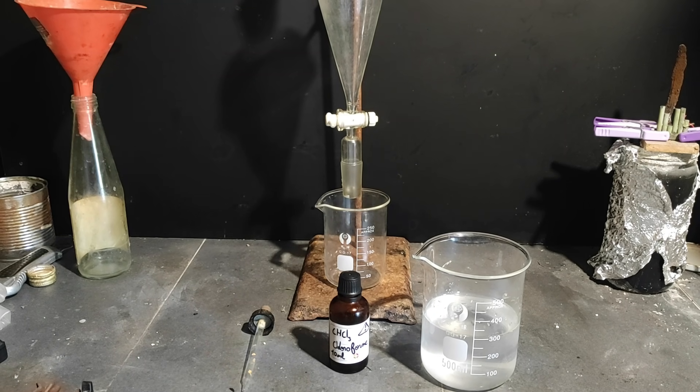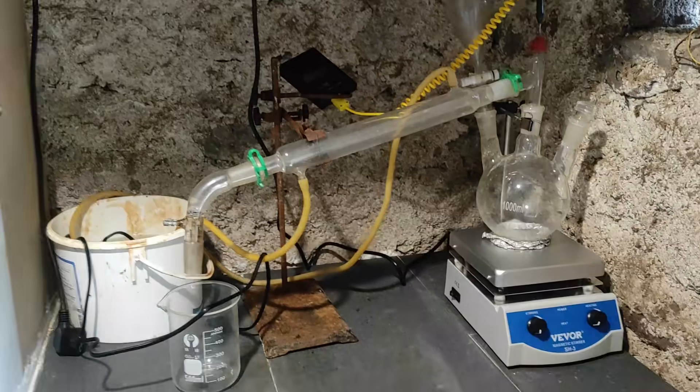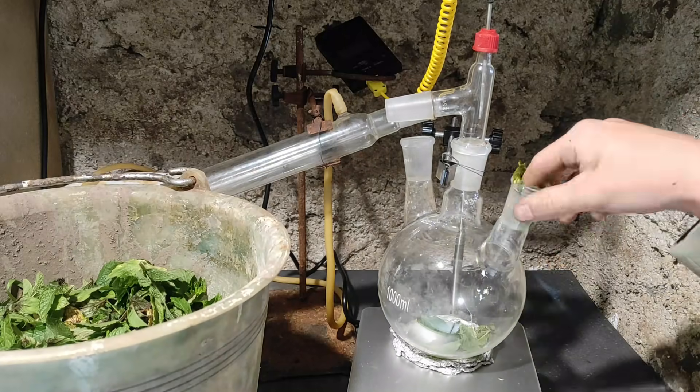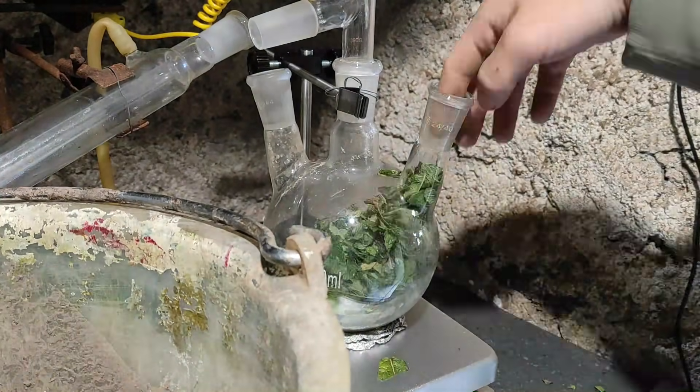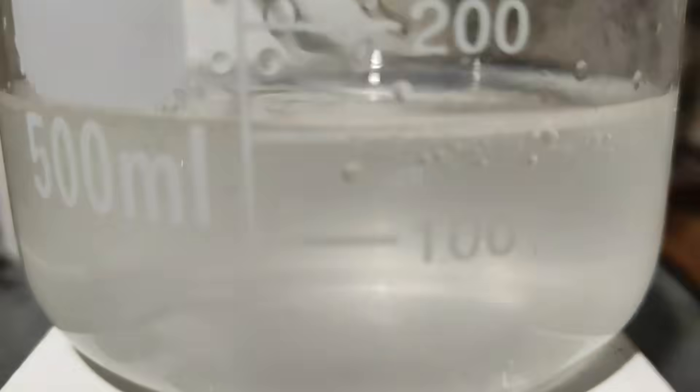To get only the menthol, we now have to do a liquid-liquid extraction with a solvent. I first planned to use chloroform as I had some leftover, but it ended up not working and I still don't know why. So I had to redo the whole leaf distillation with new leaves, getting only 150ml this time. For the solvent, I chose DCM, as I had just received 1 liter of it.